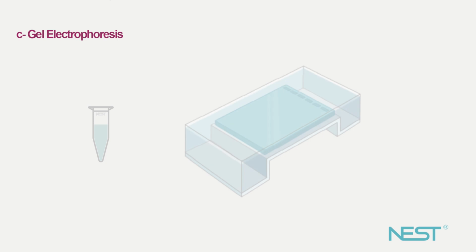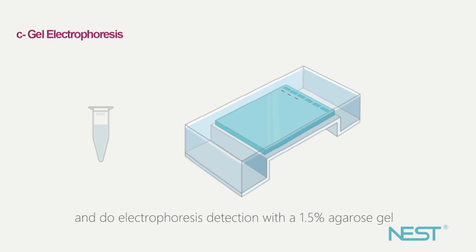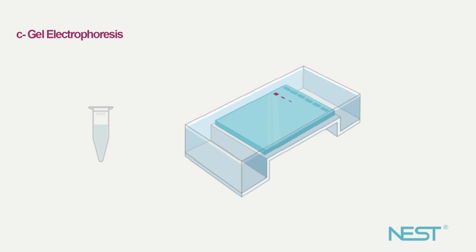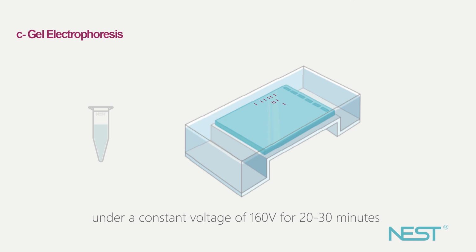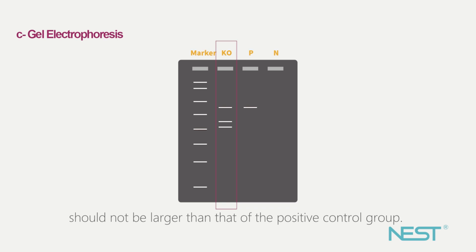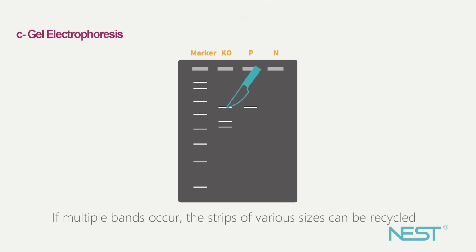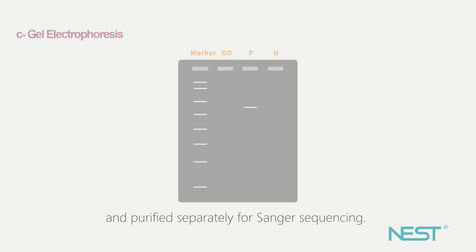Gel electrophoresis. Take 5 microliter of the second round PCR product and do electrophoresis detection with a 1.5% agarose gel under a constant voltage of 160 volt for 20 to 30 minutes. The bands of the experimental group should not be larger than that of the positive control group. Negative control group should be free of amplified bands. If multiple bands occur, the strips of various sizes can be recycled and purified separately for Sanger sequencing.